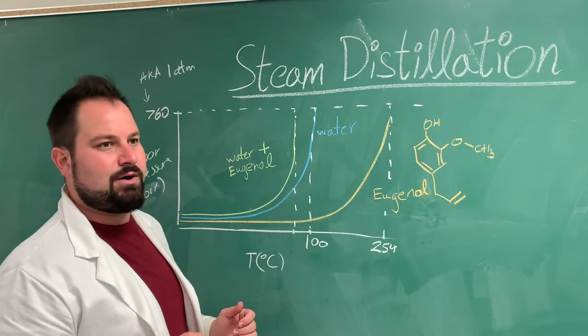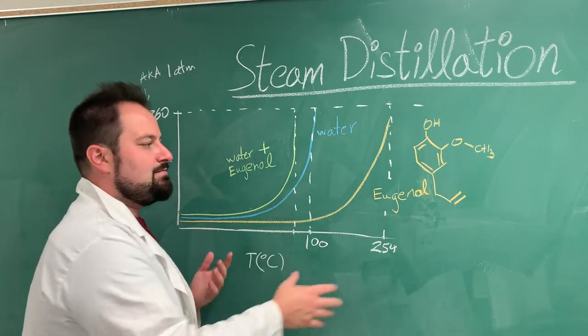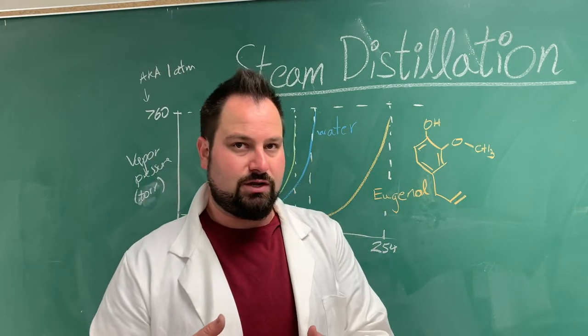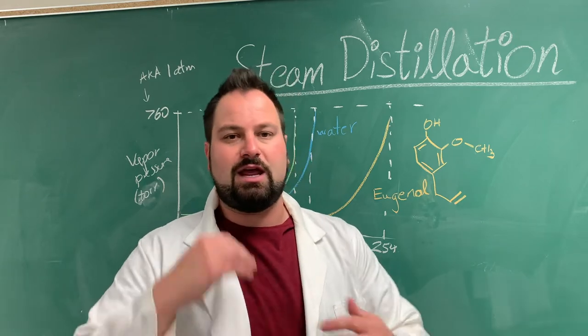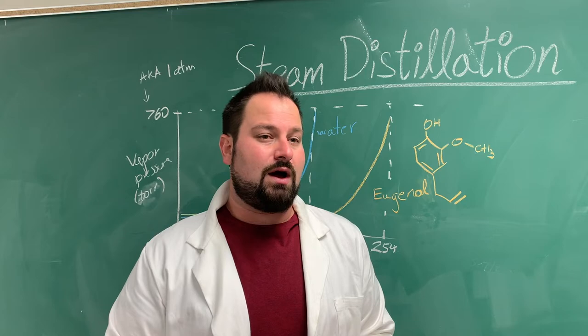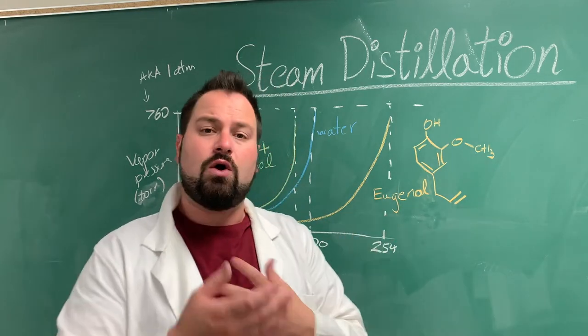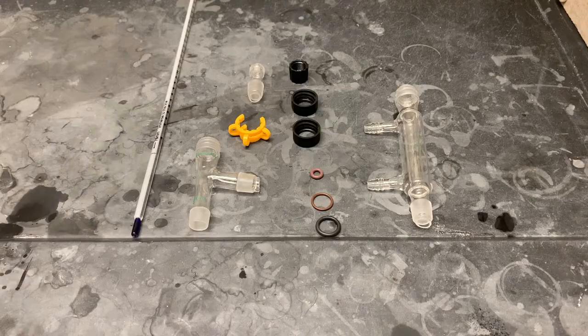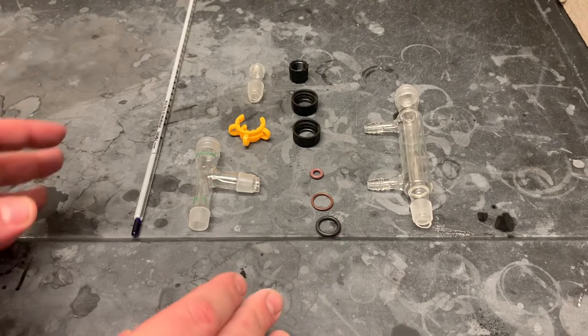We don't risk decomposition. And then at the end, because water and eugenol are not miscible, they don't dissolve in each other, you just end up with two phases, an aqueous phase and an organic phase. You can easily separate that, and then you've got your pure eugenol, or whatever compound you were looking for during your steam distillation.